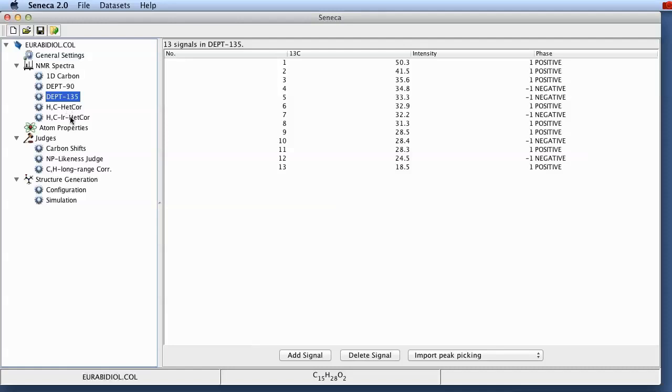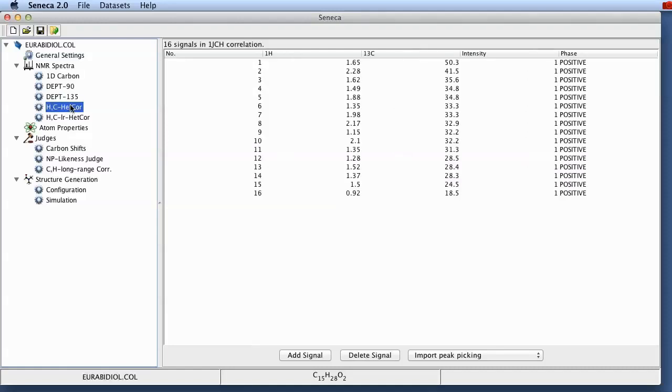And last but not least, we've also got a one bond CH correlation. We call that hydrogen carbon heteronuclear correlation here, generic name. This could be the old-fashioned CH-COSY or HSQC, HMQC, more modern versions of this experiment.